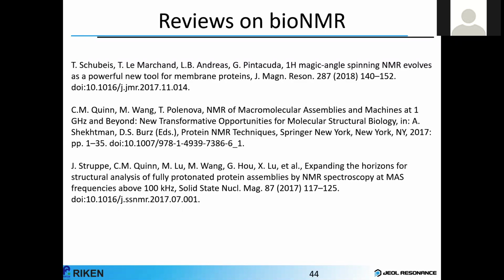So if you start spinning in helium, of course, one can spin much, much faster, because there the sound travels faster, and that's why in helium you can actually spin much faster. Now, coming to spherical rotors, I think most of us have not handled them. We have to see how far they can go, because the spinning that is being done for spherical rotors is in helium gas, versus what we all do, pretty much spinning in nitrogen or air. So that's another factor that one has to consider on spinning fast.